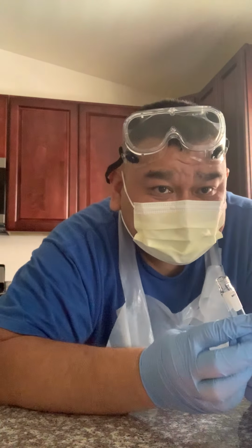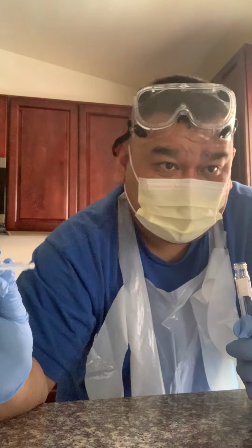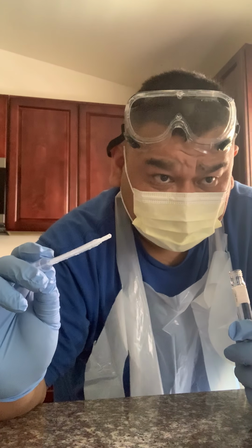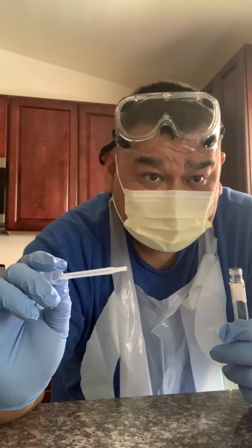Alright, here we go. Remove one dropper pipette from the alcohol and shake it well. Then it says carefully insert the tip of the pipette into the active E. coli culture and draw up a small amount of broth. Carefully drop four drops of the active culture into the MRVP tube.